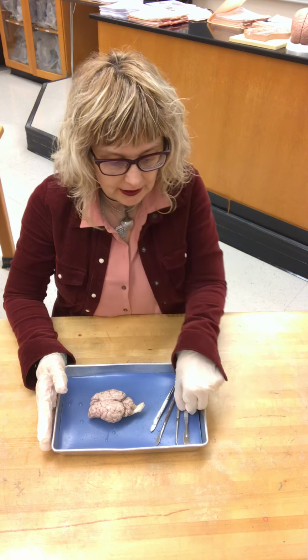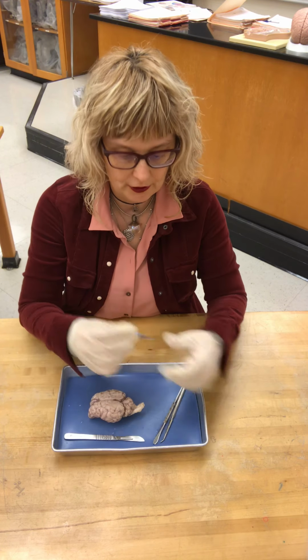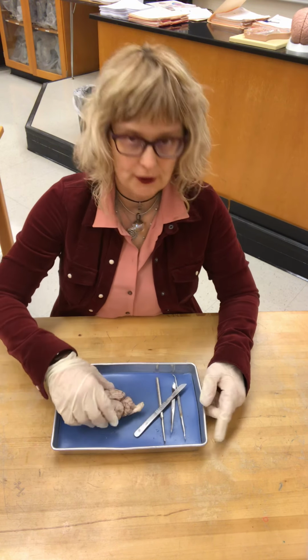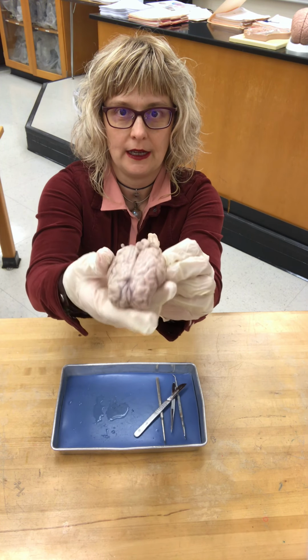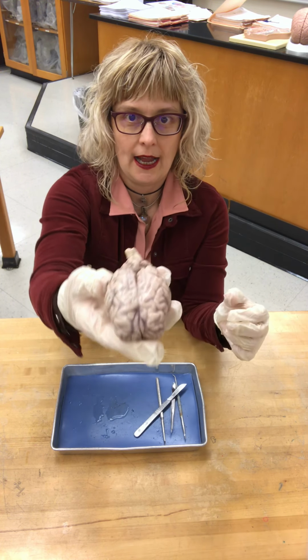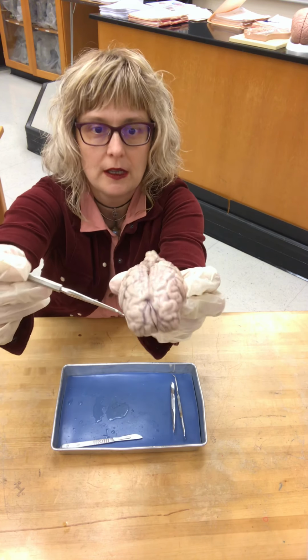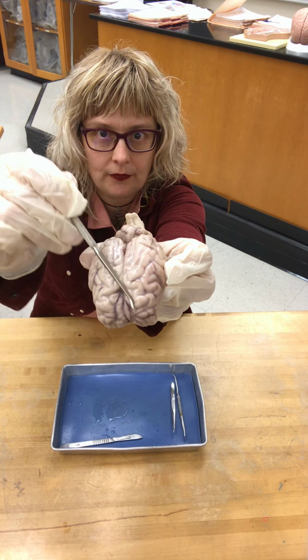All right, so the first thing you're going to need is a scalpel with a number 10 blade, and you have forceps, and then we have some probes here that we can use to be able to identify structures. So first things first, this is a sheep brain, and it is the left and the right cerebral hemisphere here that you can see. And we have this as well, and this is the longitudinal fissure. And this is why we dissect a sheep brain, because it is quite similar. So there's the longitudinal fissure, if you can see that, okay?